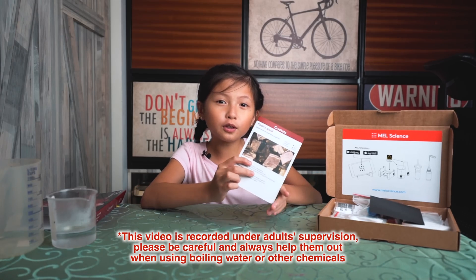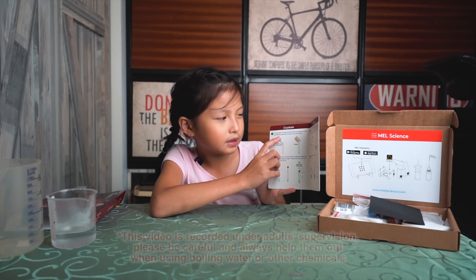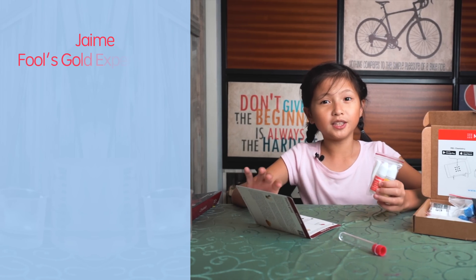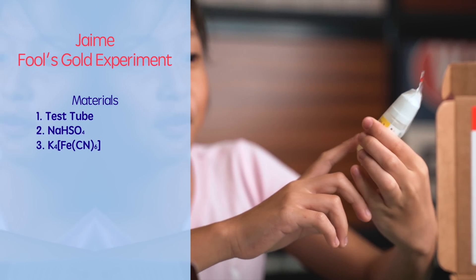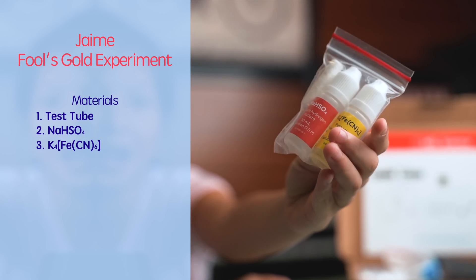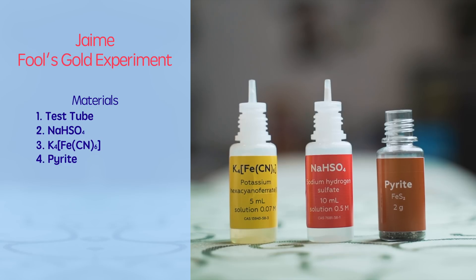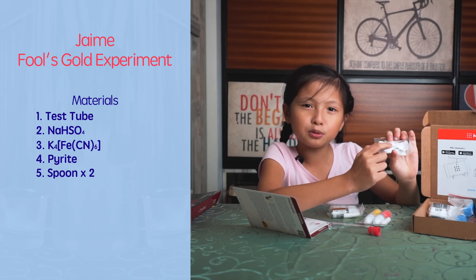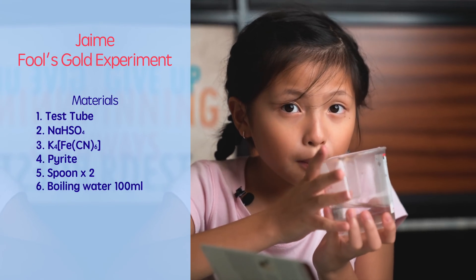We have the fool's gold experiment here. It says to mix some of this sodium into a test tube. What you're gonna need for this experiment is a test tube, Nassau, and some chemicals. It's very detailed. We also need pyrite, a big spoon and small spoon, and we also need boiling water.